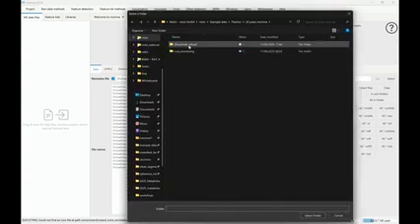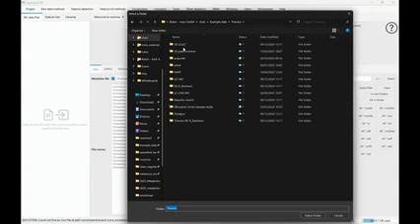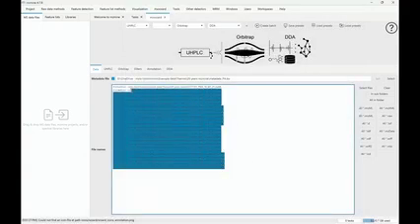And then I only have to select the folder in which I have these data files. So 20 years of mzmine and select. And it's going to get all the mzML files in that folder. Okay?